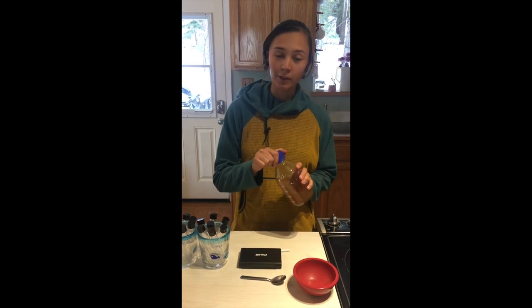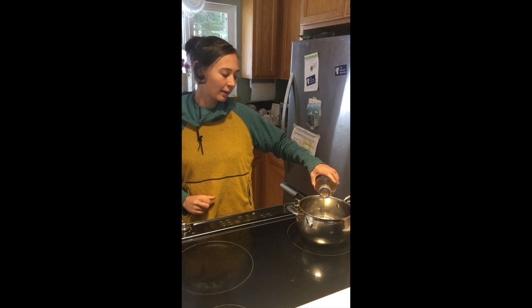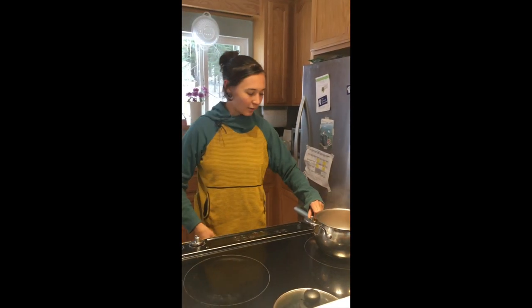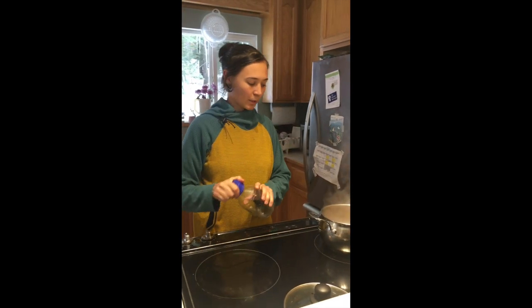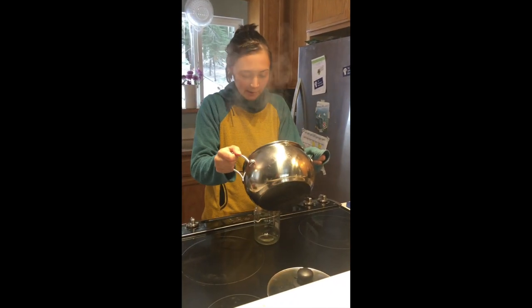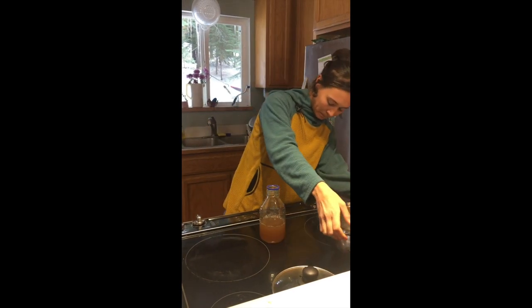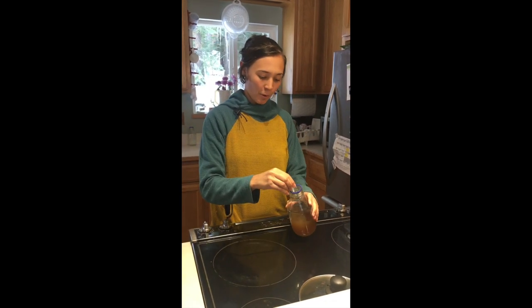What I'm gonna do first is heat it up so that once I put the agar in, the agar powder dissolves a little better. Our grain water is hot enough now — I didn't quite get it to boiling but it's pretty hot, as you can see. I'm just gonna pour it back into the media bottle.